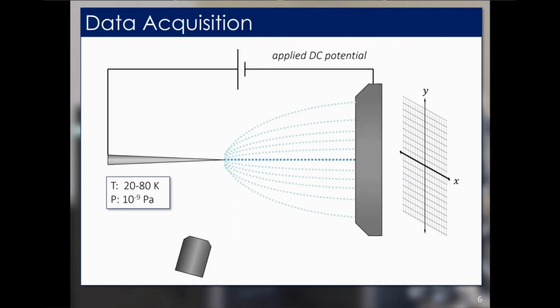Well, atom probe is able to do this atom by atom disassembly of material through the process of field evaporation. And this is the tendency of surface atoms to ionize and desorb from a material in the presence of a strong electric field. So since we want to do this disassembly of the material very carefully, we'll take our sample, we'll apply a strong potential to it, a strong electric field, but then we want to apply either a pulsed voltage or a pulsed laser onto the tip of our sample to really just pick off those atoms, ideally one at a time.